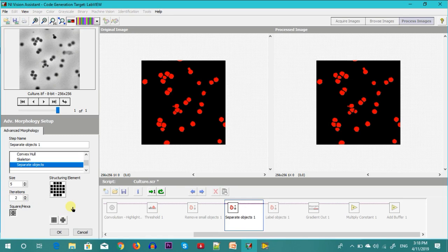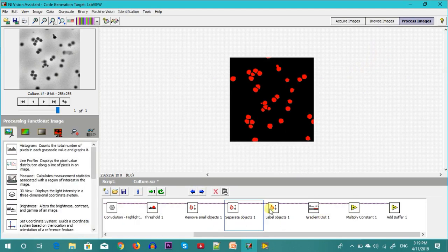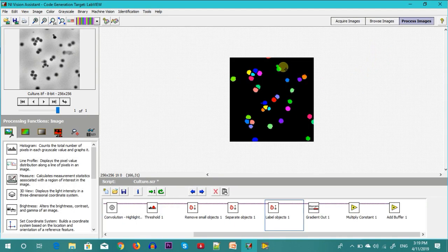When we increase the iterations, see over here they are getting separated. However the other particles are getting degraded, so we will keep it at two iterations and accept whatever errors remain — only one particle has this pattern. Labeling is done on a binary image to find out whether the particles present are separate particles or not.